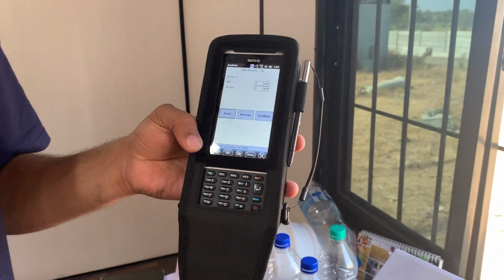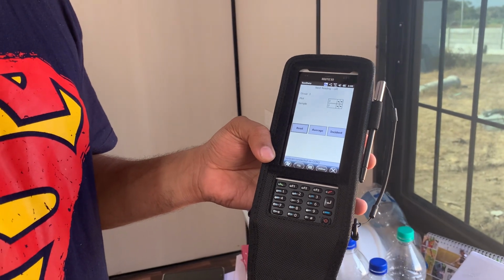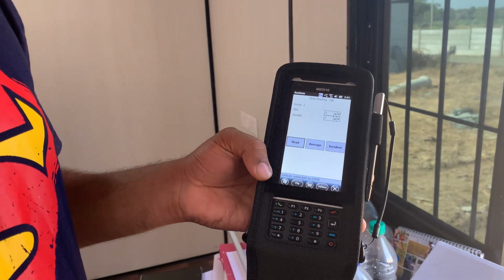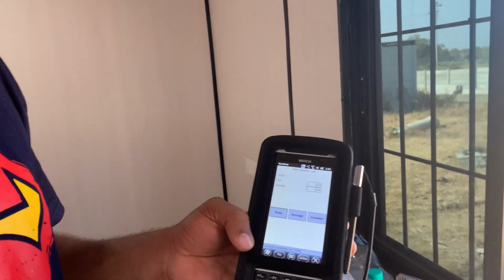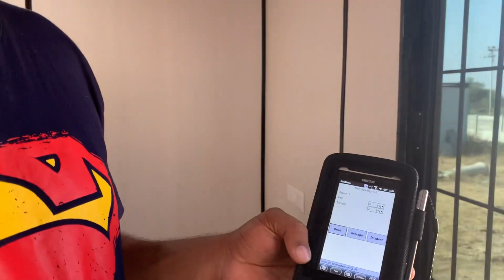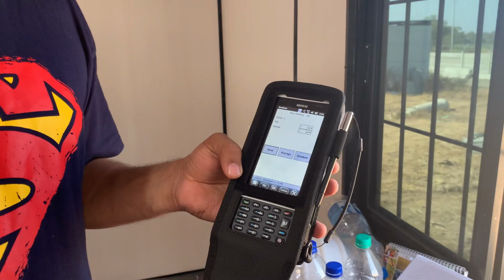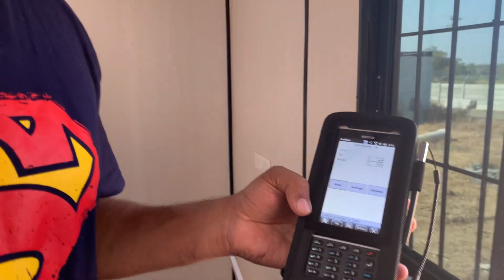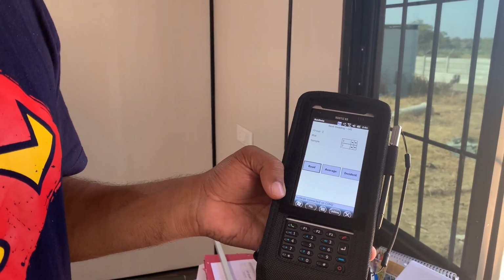Have a companion bring up a pen and pad and write these values, and that is your data, because that pen and pad or that Excel will have more information than this simple interface. It will tell you which plant you were recording at, what height you were recording at, anything you want to give which is not captured in the simple interface.